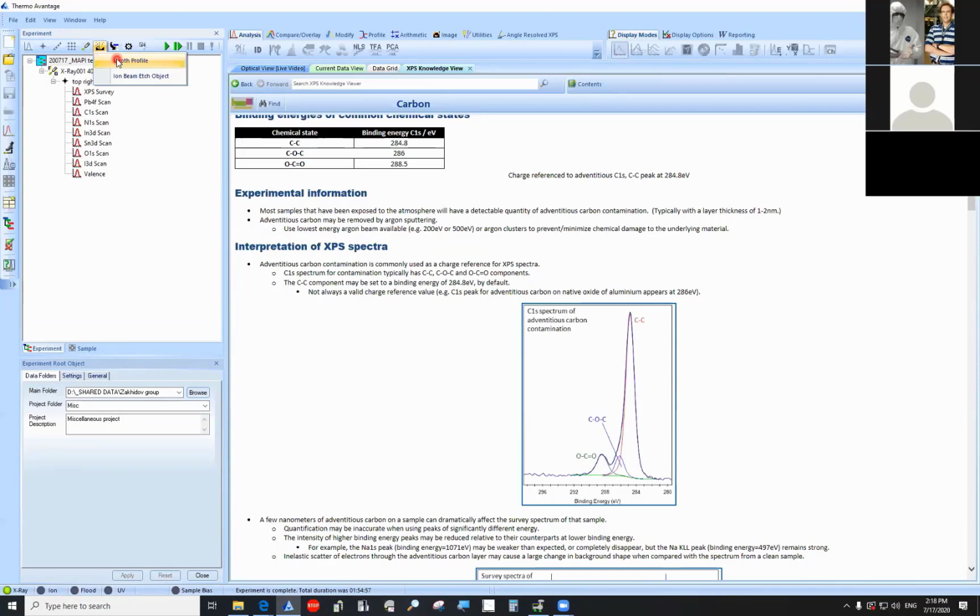So in that sense, you can use argon to mill away a fraction of a nanometer of your specimen and then recapture the data after every successive etch operation to put together, essentially, a chemical or valence state map as you move through the depth of the specimen.